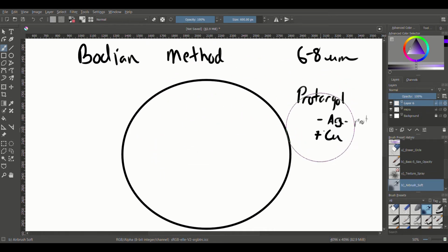So what we do is edit that a little bit by adding copper. What copper does is it replaces the silver that's deposited on the connective tissue fibers. So it competes with the silver and pushes it out. At that point, you're going to have silver kind of all over the place, but it is depositing specifically on the nerve fibers.